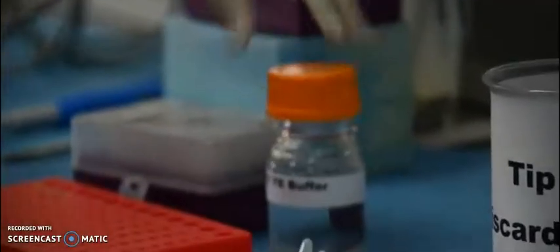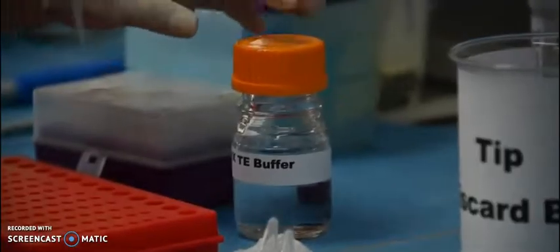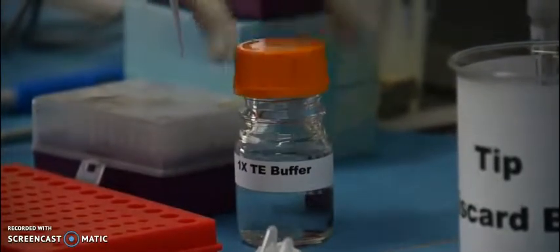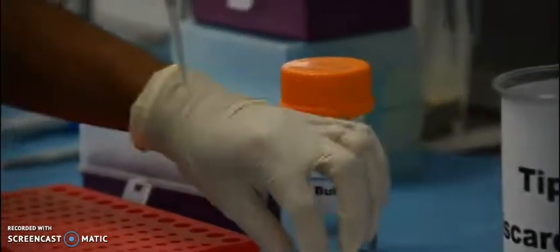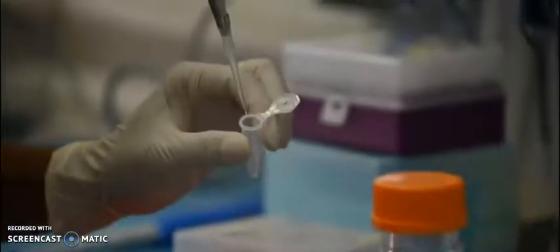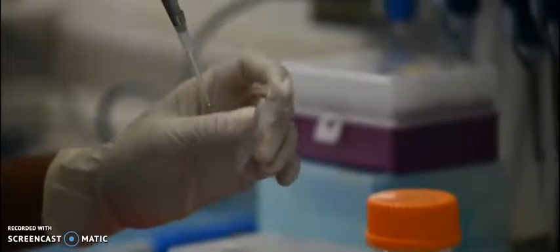Add 50 microliters of TE buffer to the pellet and resuspend it. After that, store the samples at 4 degrees Celsius for further analysis.